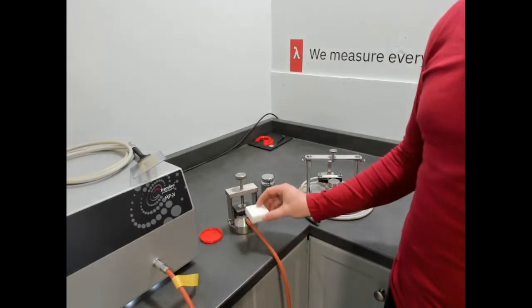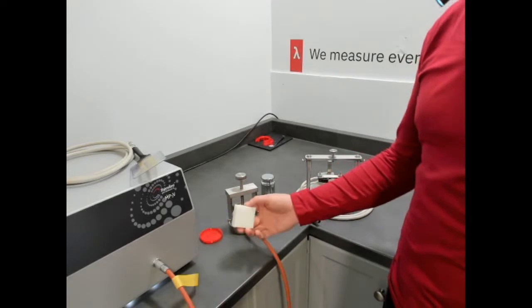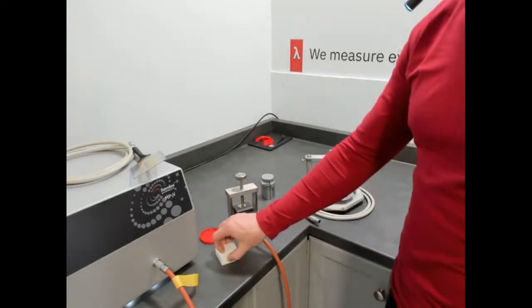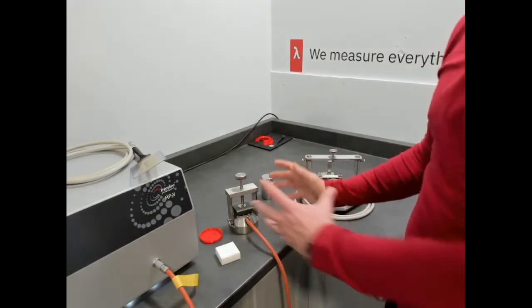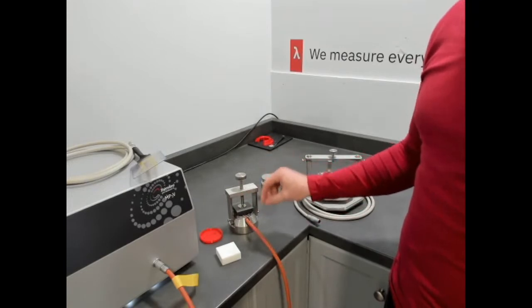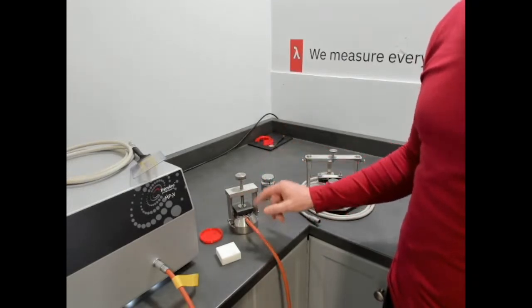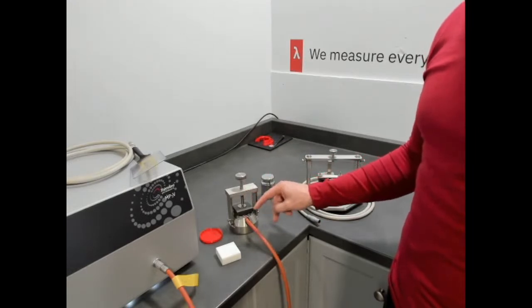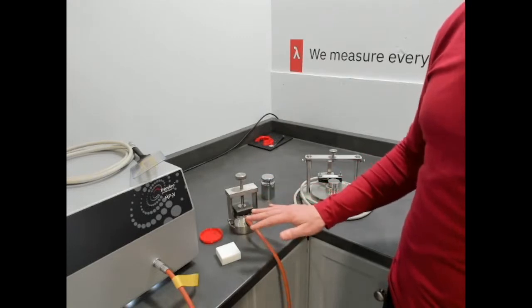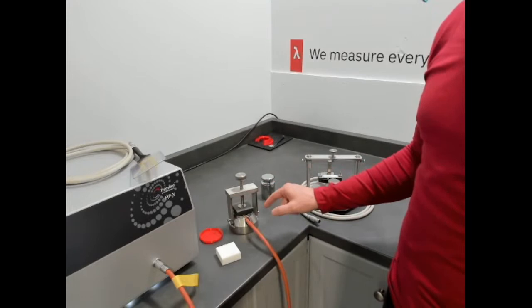The bulk sample would be exactly the same, just wouldn't need that insulation because we're working off a semi-infinite body in all directions, so we're measuring three-dimensional. The other capabilities that are included with the sensor are bulk, slab, one-dimensional, which measures along the length of a rod, and anisotropic. So in anisotropic, the module would be used for detecting differences in conductivity through thickness and in plane, and would give you the results for those. So it's quite a powerful sensor and package of modules.